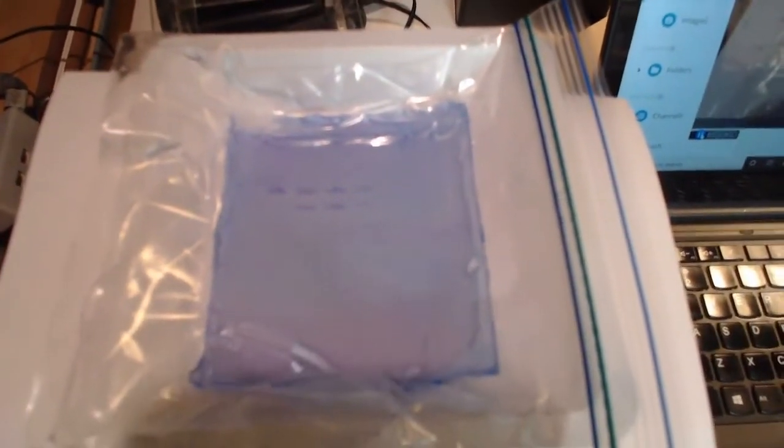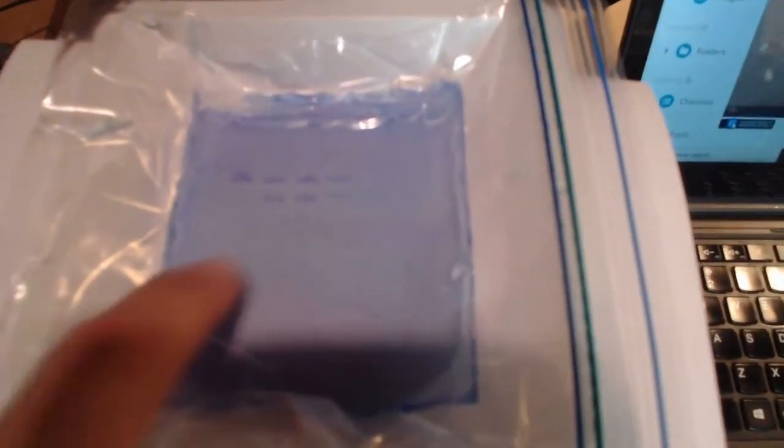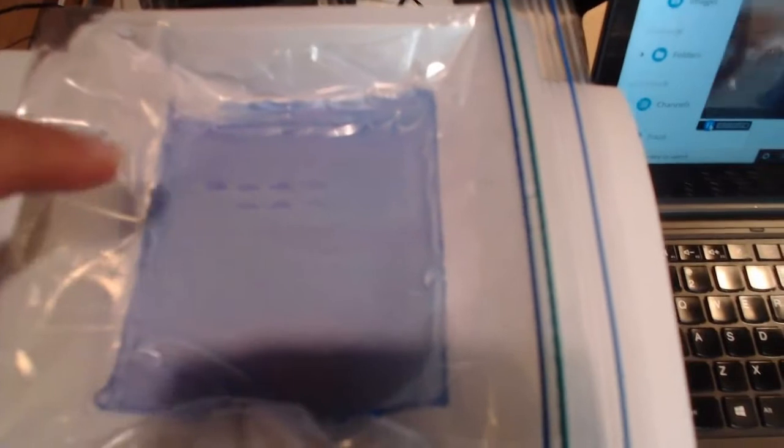We electrophoresed it. Remember, DNA has a negative charge, so it goes from the negative pole, which is up here, to the positive pole. We took the gel out of the gel box and then stained it. I stained it for about 20 minutes in the Carolina Blue stain, and then destained it with distilled water. The destain removes any excess stain that's in other parts of the gel, but the stain sticks to the DNA more tightly, so we see the results.